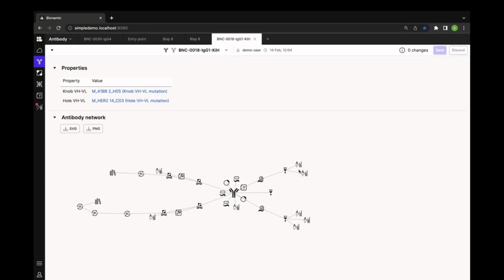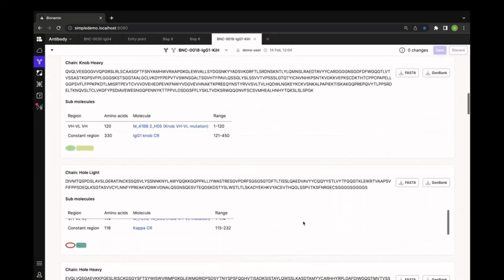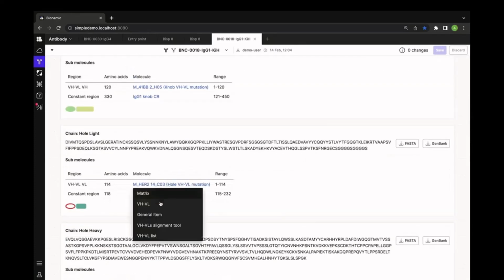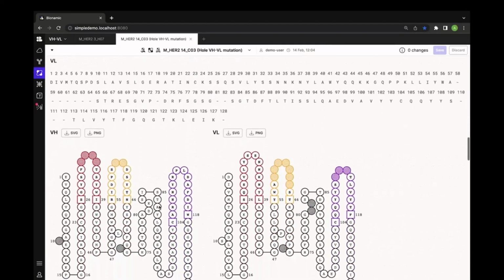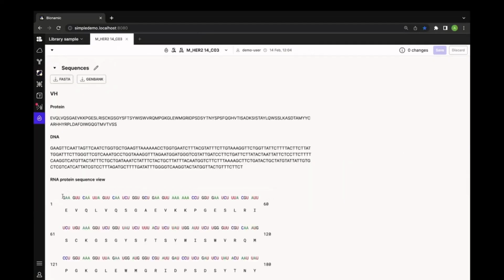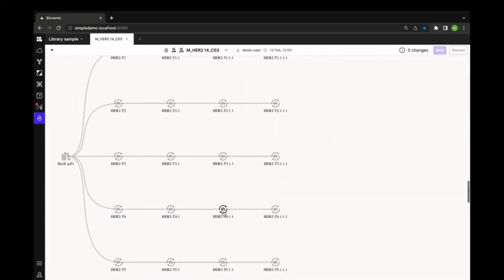And here we can see what assays have been run for each of those purification batches. And of course, we can link our way all the way back to the binder against HER2. And for this one, we can see that indeed it's been mutated, and the original clone is over here. And that clone was found in this library, and so on.